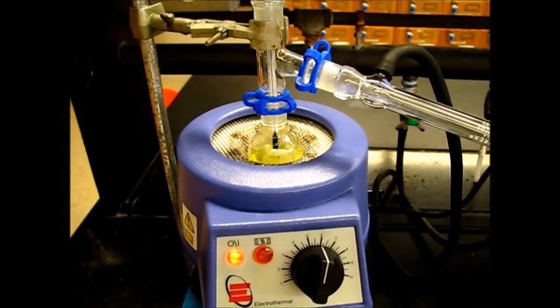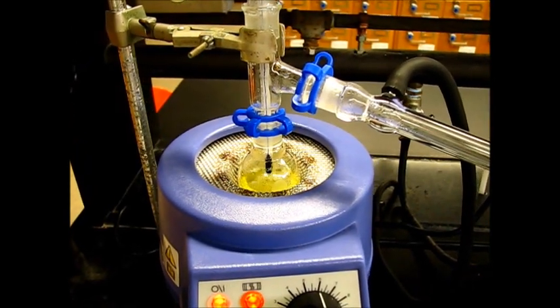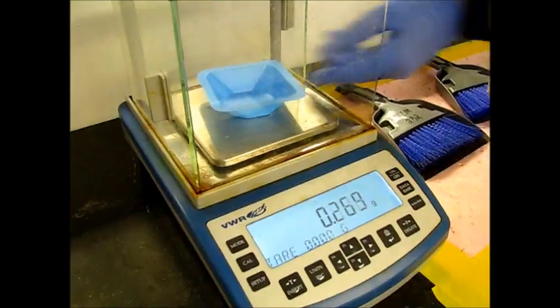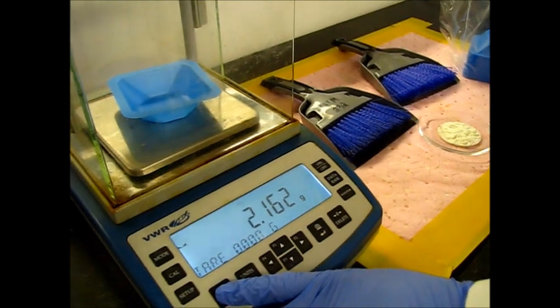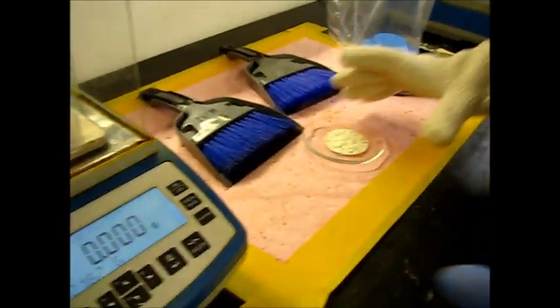Meanwhile, we have to weigh our para-nitrobromobenzene product. Now it's time to weigh the product — be careful, it's still hot.